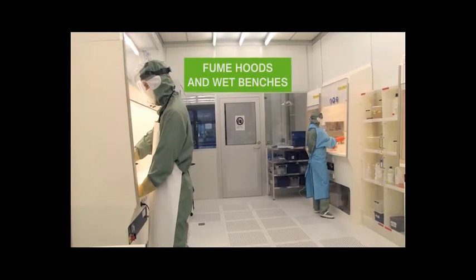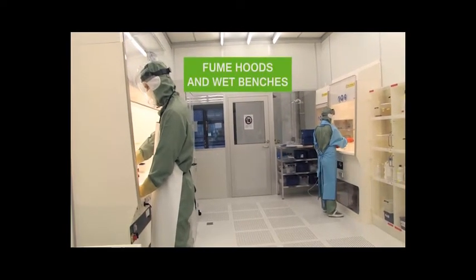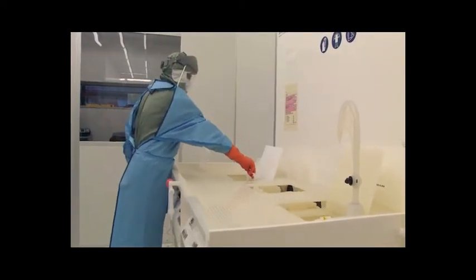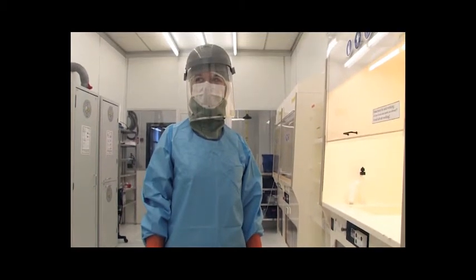In Micronova's laboratories and clean rooms, you can use fume hoods and wet benches that are designed for chemical work and equipped with air exhausts. The necessary safety equipment is provided as well.